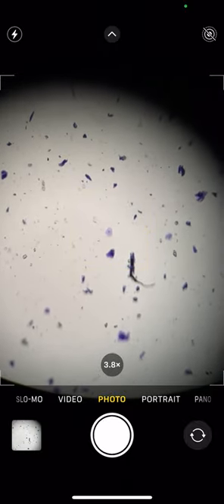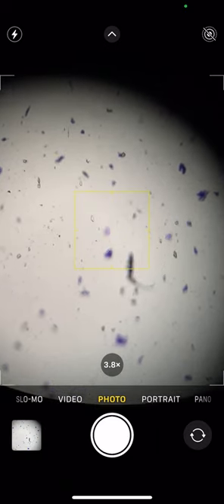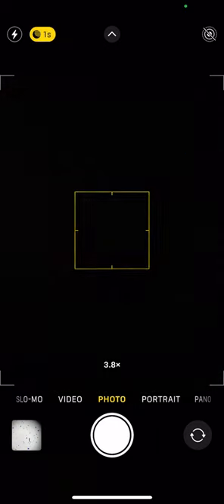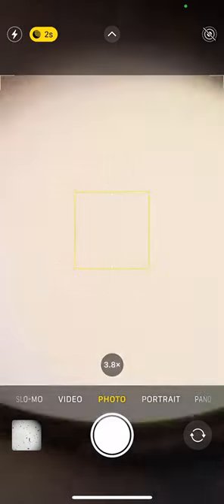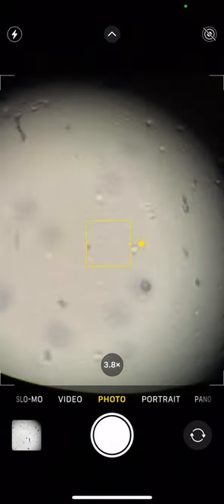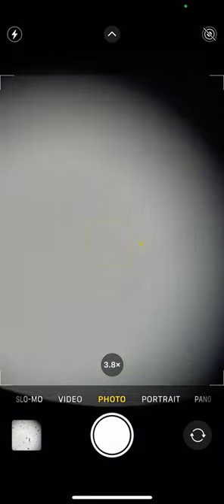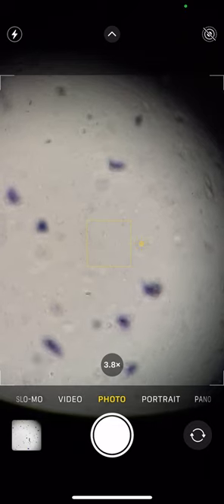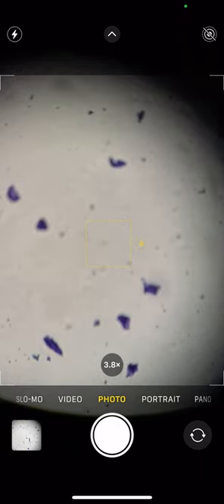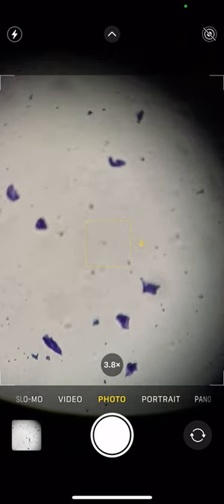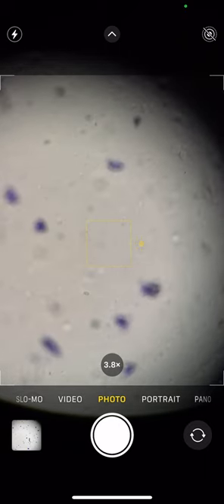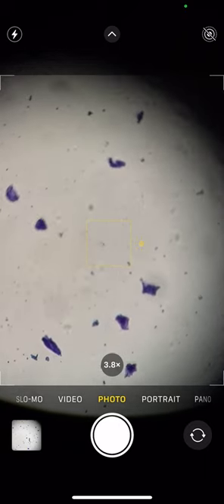Notice I am also taking pictures as I go. My genetics kids have to take pictures as they go. So it's just a way for them to kind of follow along, especially if they were absent. They can kind of use this to help them.